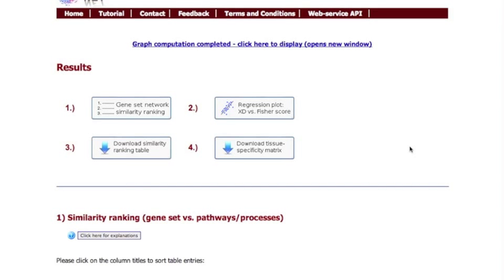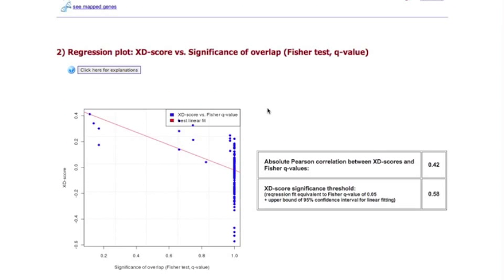Similarly, you can download the similarity ranking table and the tissue-specific association scores on the main results page. We will instead inspect a further web-based plot. This regression plot shows the relation between the EnrichNet network-based association score and the classical significance of overlap score for each pathway.